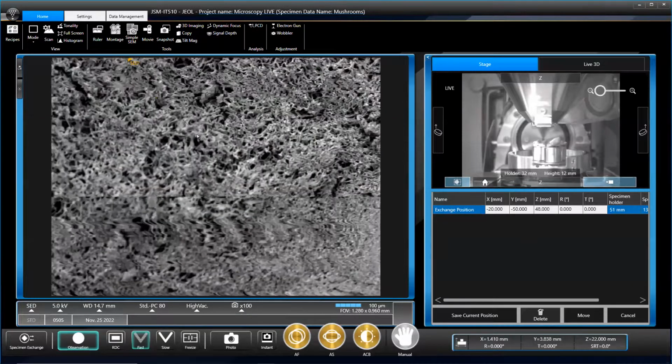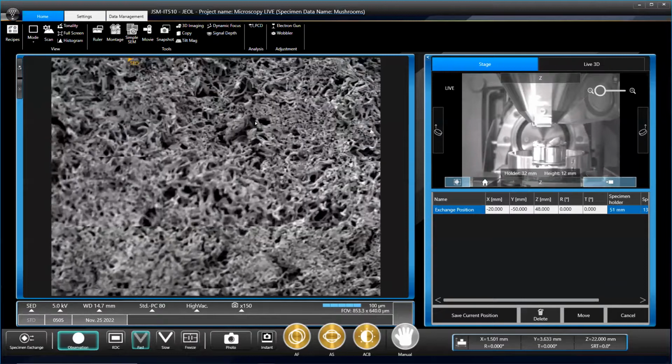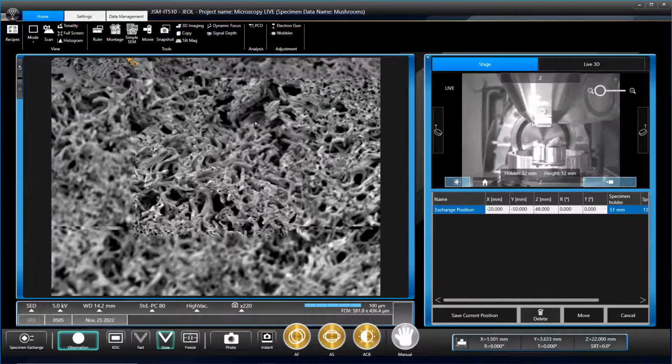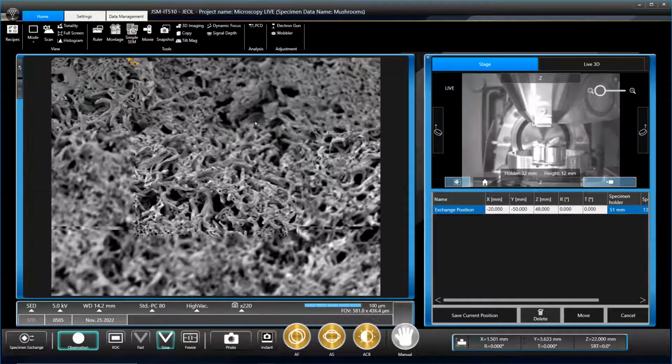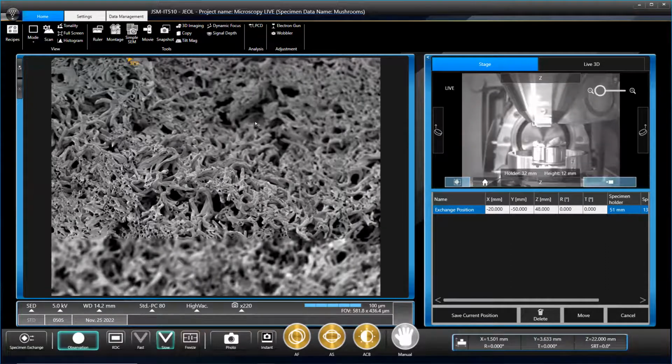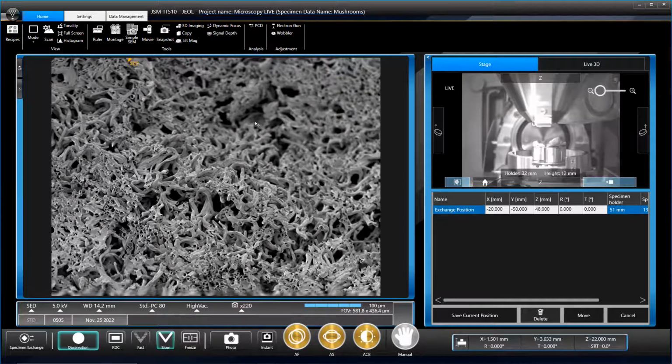We quite enjoy taking photos of things. Because of MicroscopyLIVE we get different samples we wouldn't otherwise do. As much as we love rocks, sometimes it's nice to look at something else. It's really cool to see how it can be applied to so many different things. I hadn't heard of electron microscopy until I did my master's here, and since being here I've seen how useful it is. It's quite a universal tool, isn't it? It's basically everything that isn't a liquid and can fit in there.